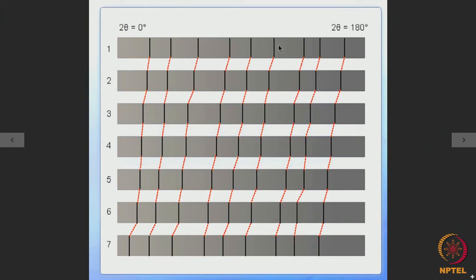This is bound to happen because B atom size is bigger, B lattice parameter is bigger, B d values are bigger than those of A. Automatically these will be shifted more towards lower theta values, and these towards higher theta values.